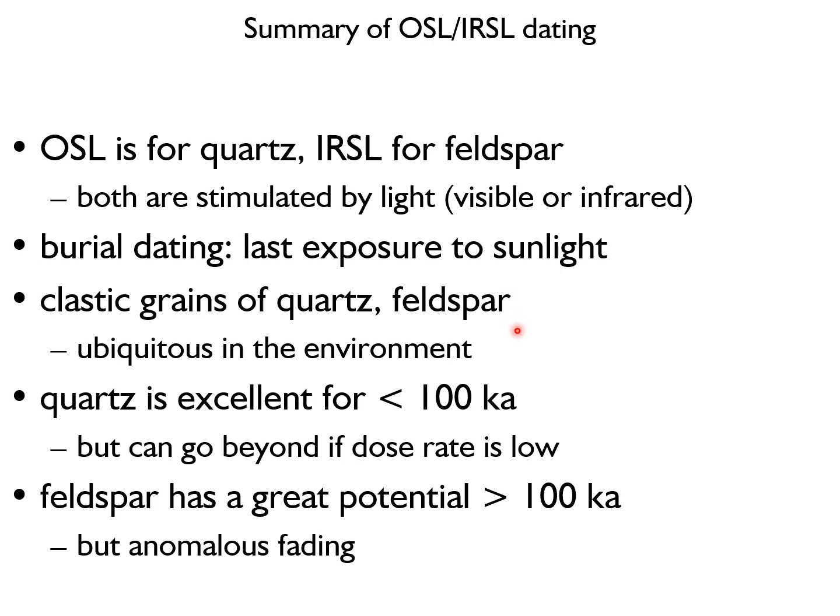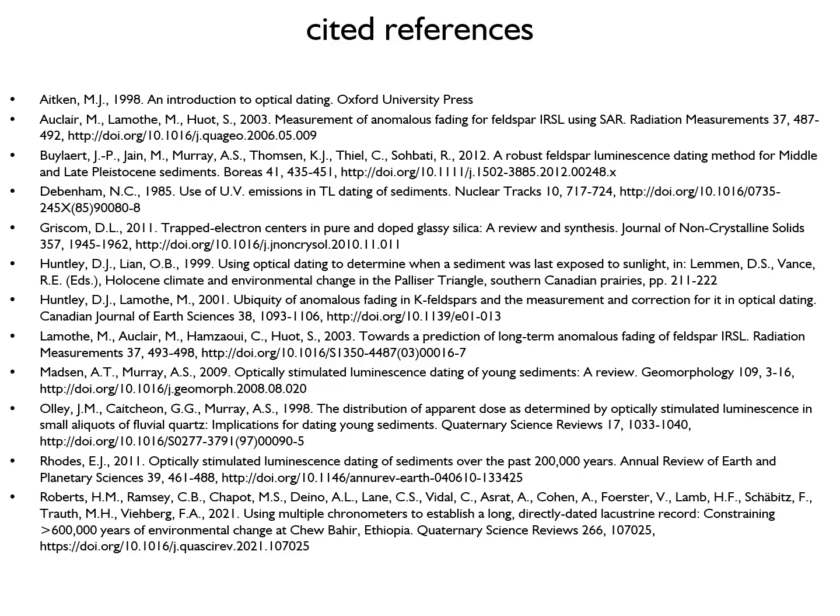Quartz is excellent up to about 100 ka, but we can measure older ages as long as the dose rate is very low in the environment. And for feldspar, we can measure older ages, but do be certain to take care of the problem of anomalous fading. And finally, you may pause to look for references.